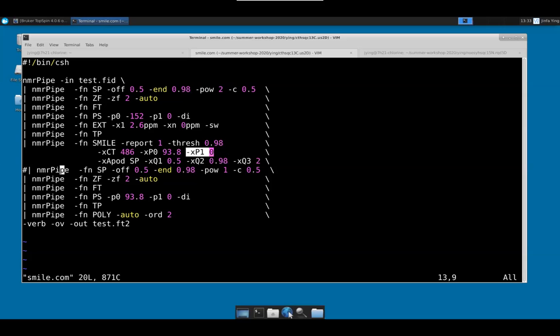Okay, that's why I gave you an additional parameter for the scaling factor. All right. Okay. And that's important for the direct dimension as well. For which one? For the indirect. That is important for the direct. Yes, yes. The direct dimension, it's saved in the header, so I know it. That's why I don't need to do it. Like here, the Y dimension, you don't need to do anything. I read it from the header.